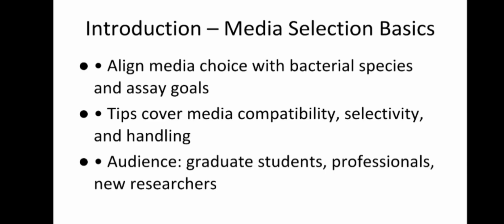So think fast about which organism you are working with and why. How do we isolate it? And how do we go about performing AST, also called antimicrobial susceptibility testing? This guide and this series will illustrate how to match media to your bacteria.